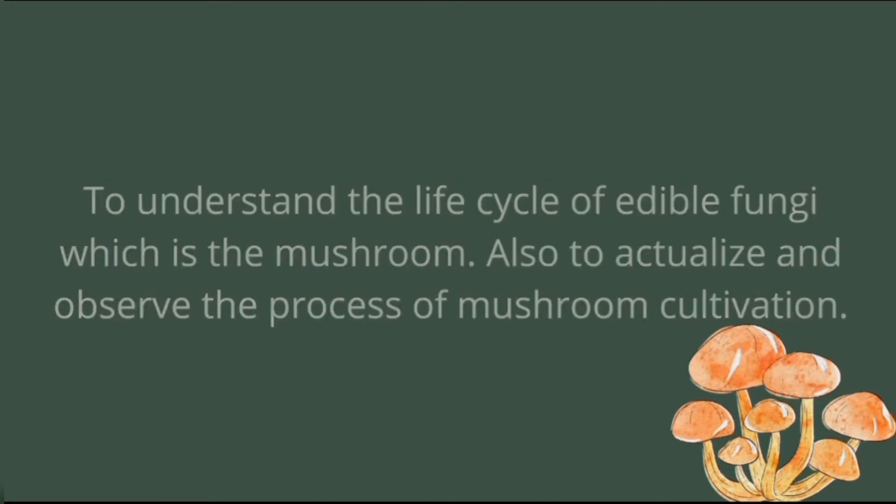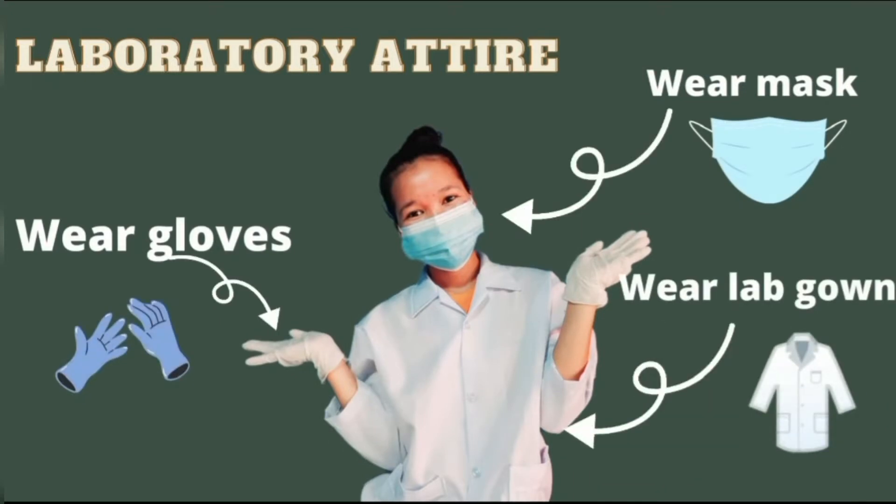But before we begin, we must wear the laboratory attire, which is to wear gloves, face mask, and lab gown.